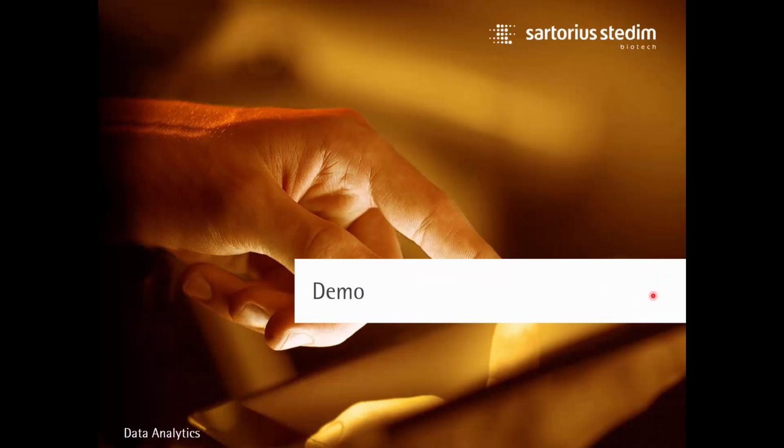This brings us to the stage where we will now leave PowerPoint for a while and go over to the MODDE software and conduct a little demo of this use case. I emphasize that the demo will concentrate on setting up the experimental protocol, giving a detailed walkthrough of the dialogs and windows where you specify the properties and settings applicable to the generalized subset design. We will not so much discuss the data analysis stage, because that we have covered in other presentations.